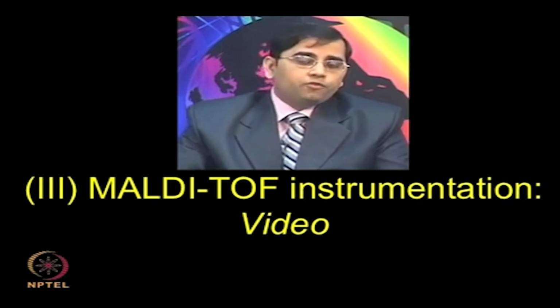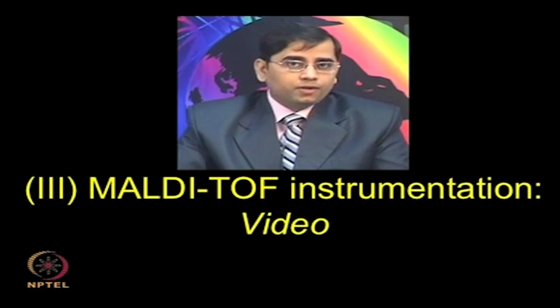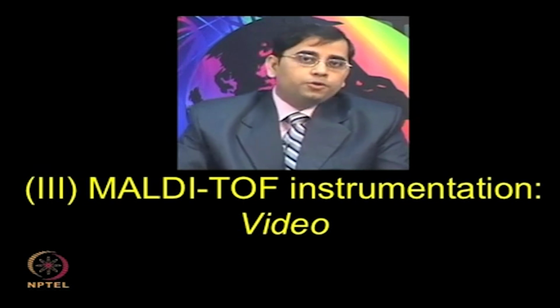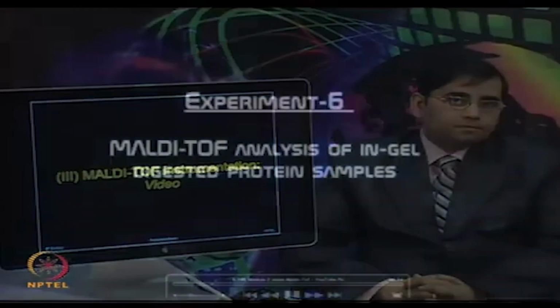Now, there are various types of configurations of these instruments available, as well as various types of commercial software which help to operate the hardware. It is not possible to go into individual detail, but I am going to show you the generic steps in the following video of MALDI-TOF instrumentation.